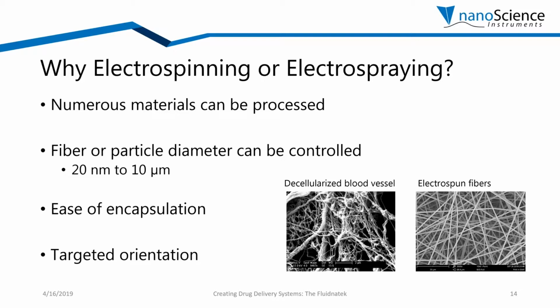Typical fiber formation methods like hot melt extrusion operate at high temperatures. Therefore, if you're using a polymer blend, unwanted copolymerization cannot be controlled. Instead of having two materials, you're going to combine them and have an undesired material. And with solution electrospinning, this can all be avoided.